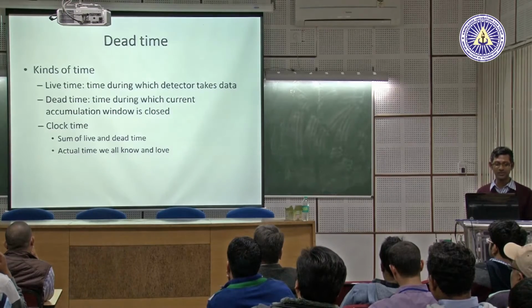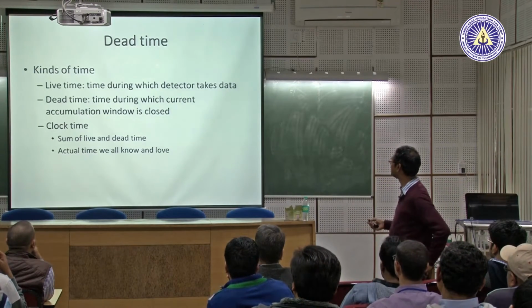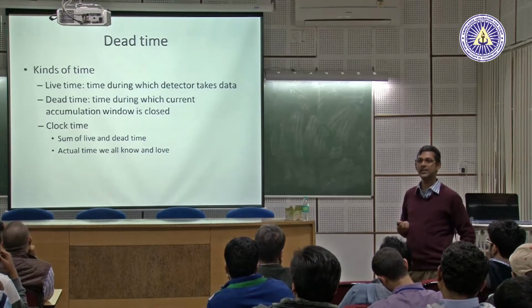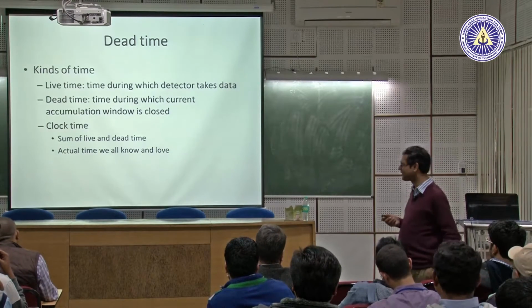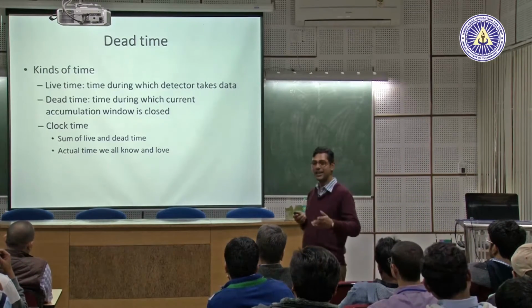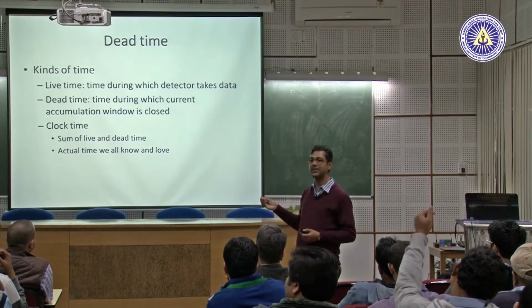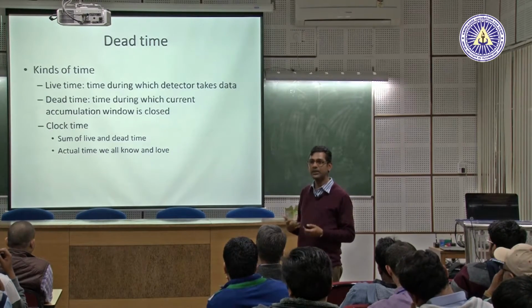In EDS detectors, there is something known as dead time. Dead time really means dead time. The detector is dead, and this is very important. What is this? Well, these are electronics, right? You feed the X-rays onto these detectors, and it takes time to analyze the data.